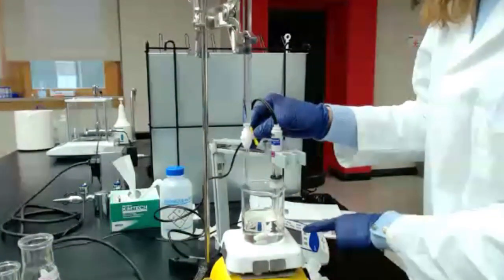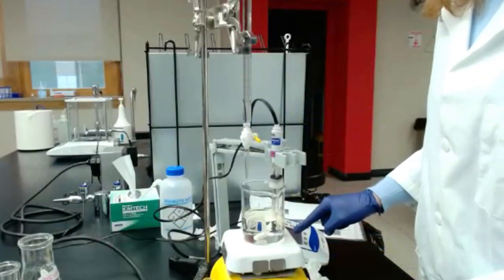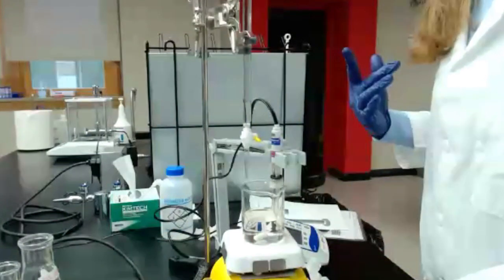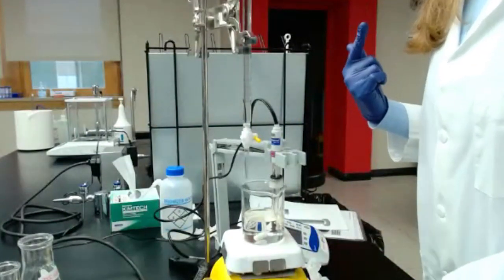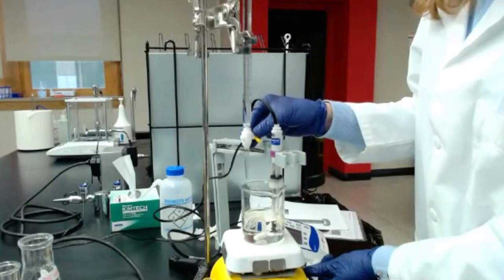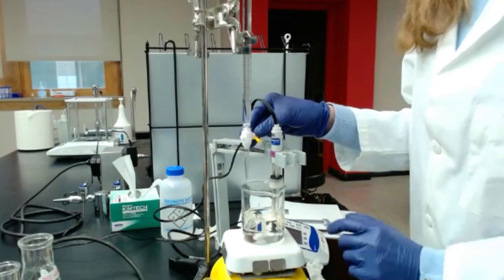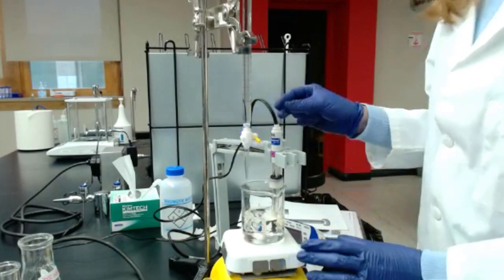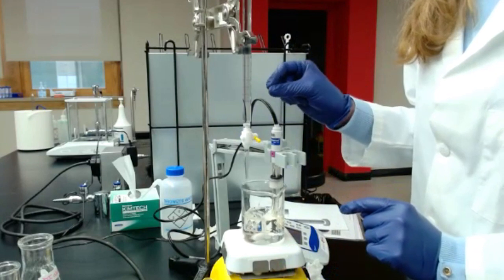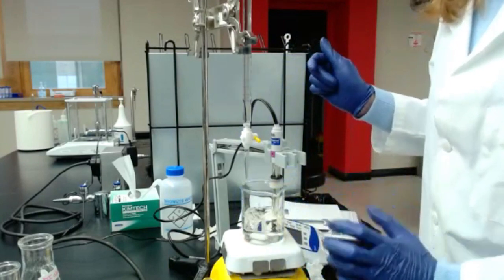Once it gets close to pH 6, in a few drops, you're going to have a really high increase of the pH. So always do it under stirring, and that's where it's beneficial to have a stir bar, because opening the tap and stirring at the same time won't be really easy to do.